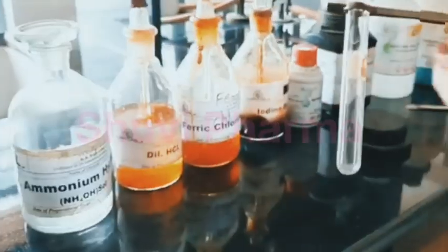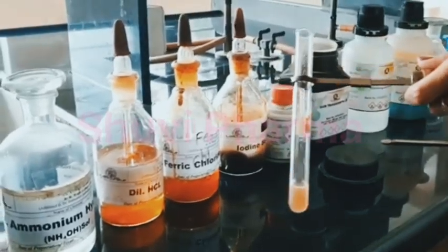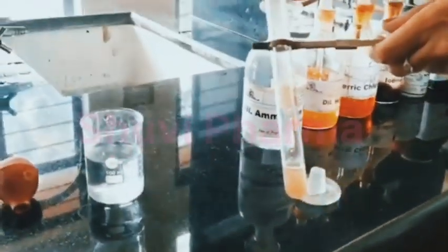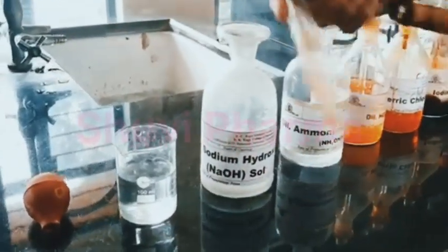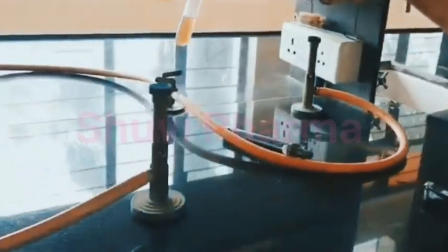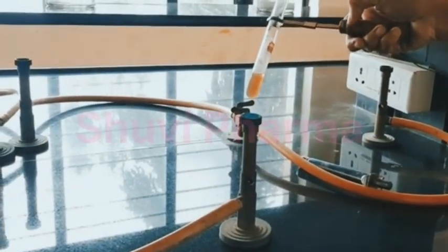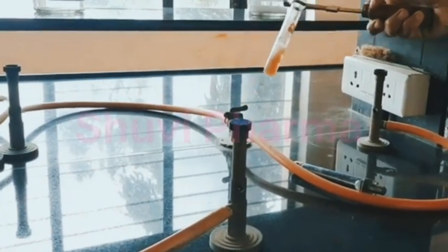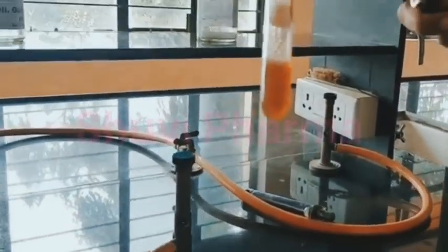Next is the sodium hydroxide test. For that we'll take a test solution in a test tube. To that we'll add sodium hydroxide solution. And we'll warm over a water bath. Here a canary yellow precipitate is obtained after warming the solution. So it indicates the presence of tragacanth.